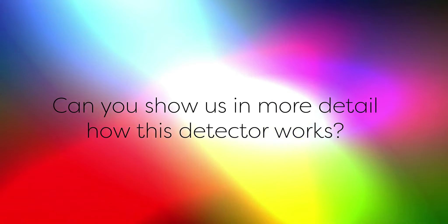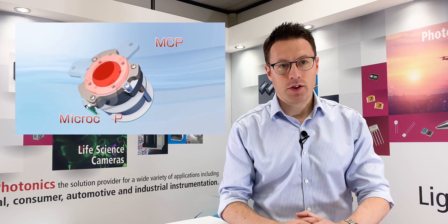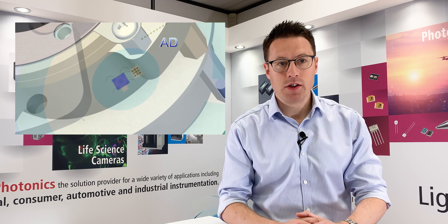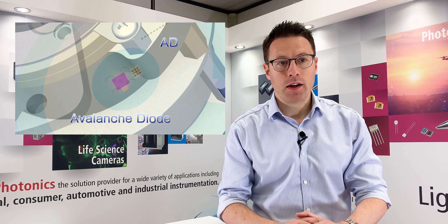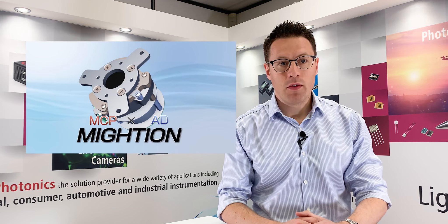Can you show us in more detail how this detector works? Sure. Here is the basic structure of the MightION. The MCP sits at the front of the detector with the avalanche diode situated towards the rear. These elements are enclosed within a compact mechanical assembly. Ions entering the detector move towards the MCP and undergo ion-to-electron conversion.